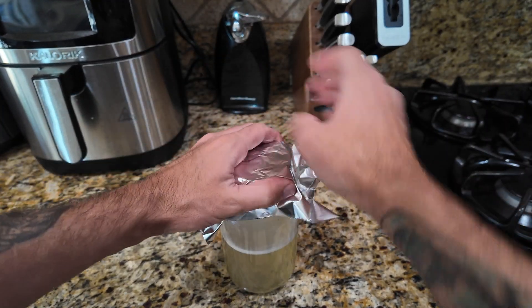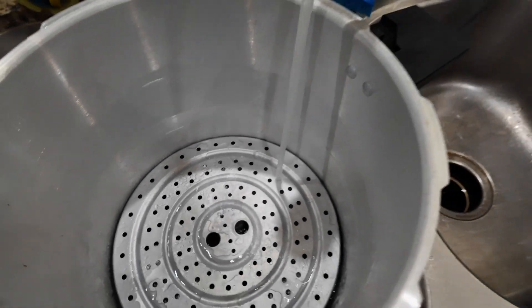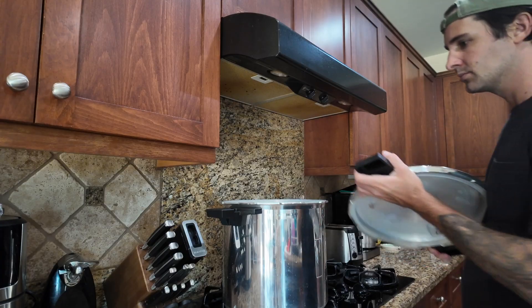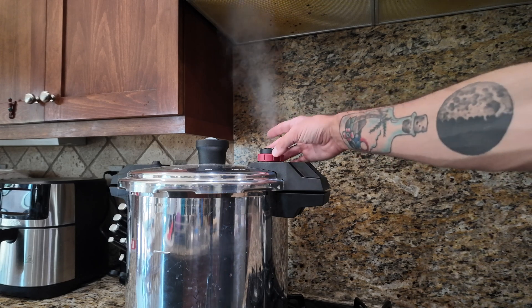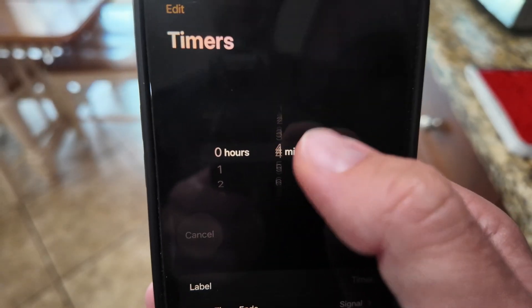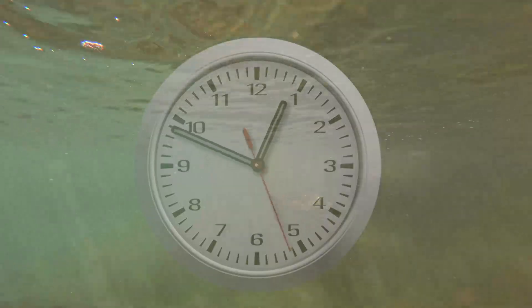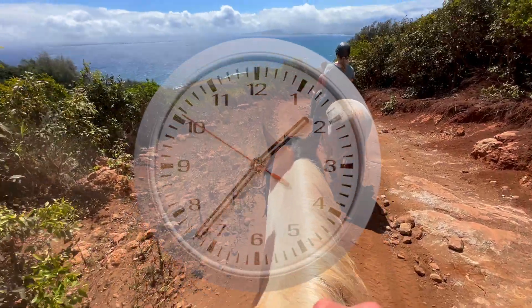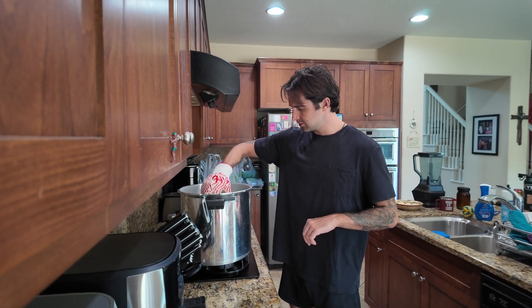Check your manufacturer's instructions for how to operate your pressure cooker. I drop three liters of water in the bottom of my 22-liter pressure cooker and elevate the platform so the mason jar isn't sitting in the water — just resting on three balls of foil, two or three inches off the bottom. We'll close the pressure cooker and turn the heat on. Once there's a steady flow of steam for 10 minutes, close the valve and let the pressure build to 15 psi. Once we hit 15 psi, start a 25-minute timer. After 25 minutes, shut off the heat to complete sterilization, let the cooker depressurize naturally, then remove the jar. Once the jar cools to room temperature, it is ready to inject.